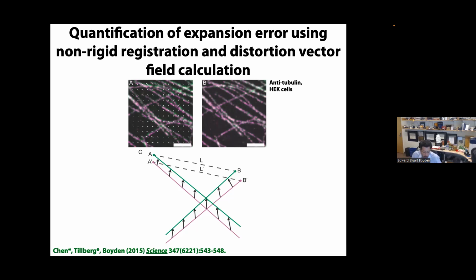with a regular microscope. So here we're using some cells with proteins, in this case microtubule proteins, decorated with fluorescent antibodies against tubulin. In light microscopy, for the most part, we're imaging fluorophores or other contrast agents that are bound to biomolecules. And we took the pre-expansion image, in this case with a SIM super resolution microscope, shown in purple, and then in green and overlaid in these images is the post-expansion image taken with a regular old confocal microscope.